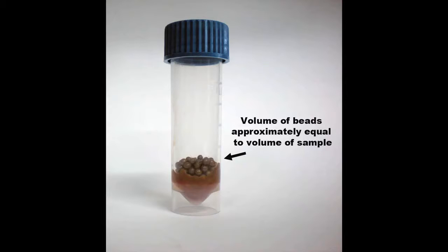If you would like to add beads by mass instead of volume, the protocols on our website, www.nextadvance.com, will give you more specific information.